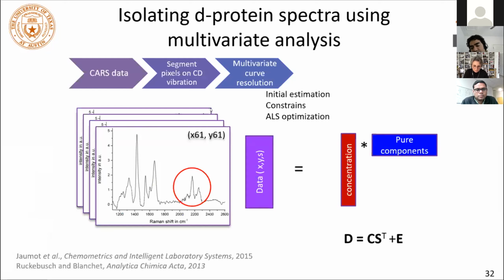What you do in this process is you give your data set, which is position versus spectra, and you need to have a lot of spectra for this to work at all. In fact, you need to have more spectra than spectral data points. Otherwise, the problem, which is already overfitting, is even more overfit and has absolutely meaningless information coming out of it. In this case, we have 700 spectral data points, and a 512x512 image, or many 512x512 images, so for each one we have this 512x512x700 dimension. What you do then is a linear decomposition on that in a rotated basis set. If you just type PCA into something like MATLAB, it will do this for you in about 10 seconds. But that will give you both positive and negative spectral components across the spectrum, which has nothing that you could identify as anything from reality.